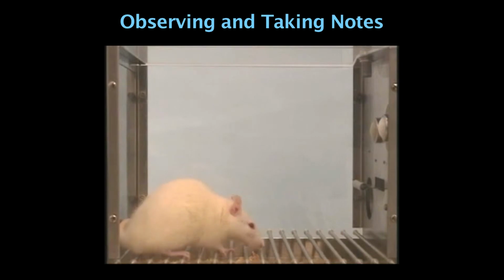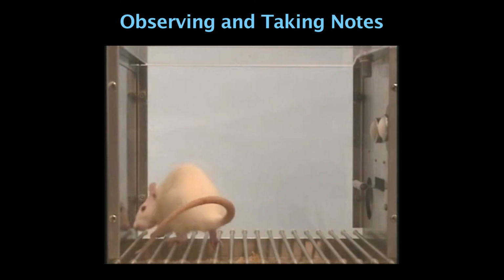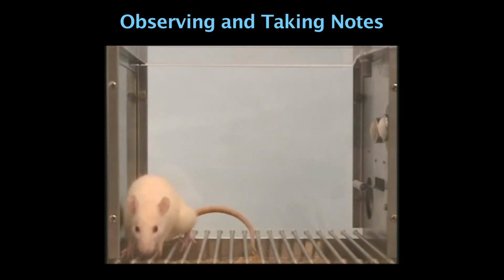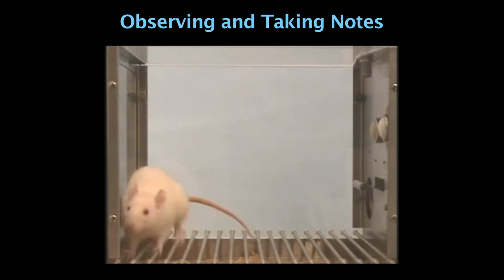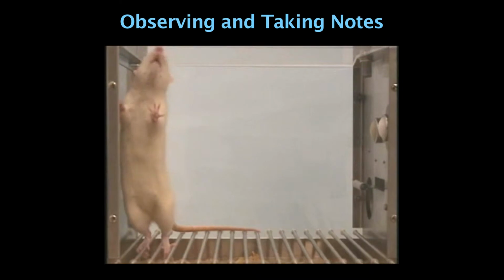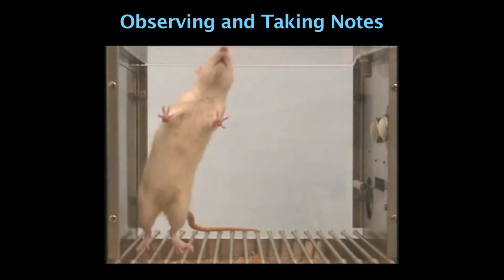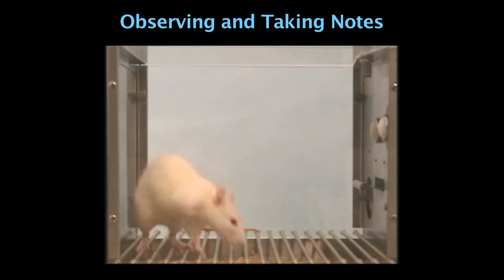We'll begin by observing an animal for some period of time. If we have not yet created a set of categories to formally describe the behaviors of this species, we must begin by making a set of observational notes that describe the interactions we observe between the animal and its environment. We'll use simple descriptions, like the animal moving from one part of the chamber to another, rearing up to sniff and explore the upper portions of the chamber, moving again.